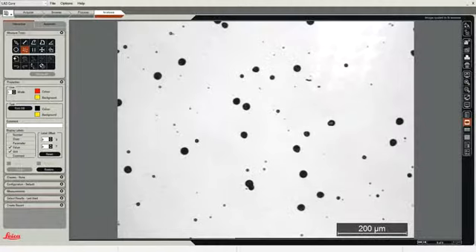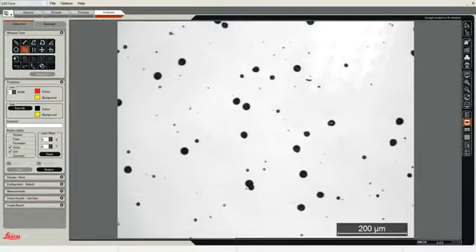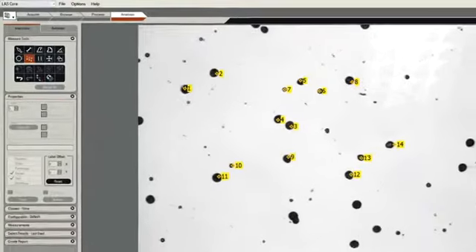One of the measurements that is frequently required in examining images is a simple way to count the number of objects that are in the field of view. In this simple alpha track specimen, you might think that you can easily click on each individual object and count the tracks. It's quite simple and doesn't take very long to count one image. But if you had many images to count, you might find that a little tedious and time-consuming.